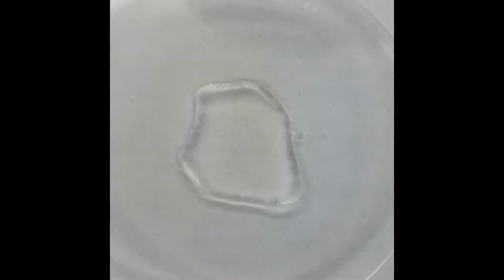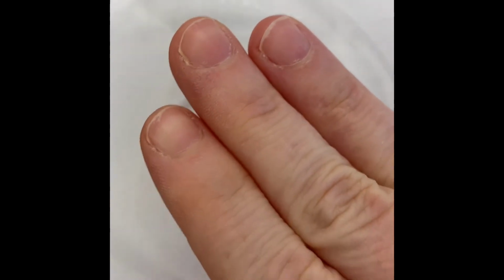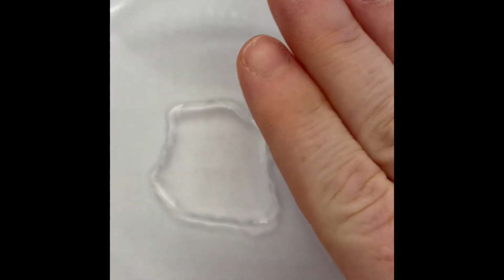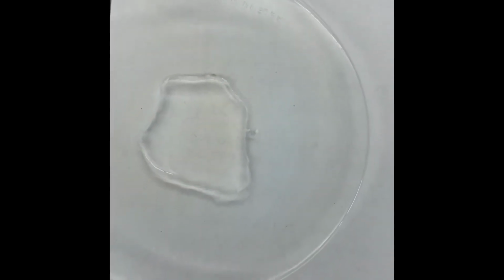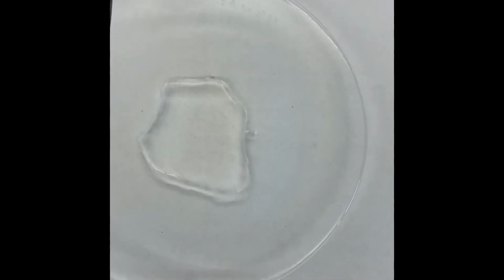Doesn't look like anything's happening. Let's check for change in temperature. No change in temperature. I think it's safe to say that nothing is happening here.